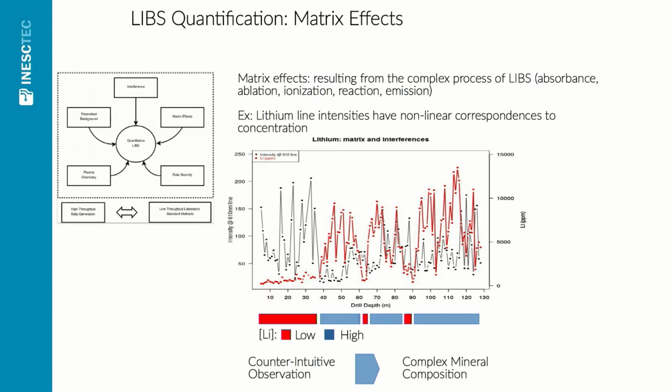This happens because of the natural distribution of the geology. Spodumene is associated with quartz crystals, and the quartz crystals and spodumene not only are hard, but they absorb much less of the laser. And the plasma efficiency of breaking down the quartz crystals' molecular structure, and the absorbance, makes the signal within the spodumene vein much less sensitive to the lithium emission than the first part of the drill.